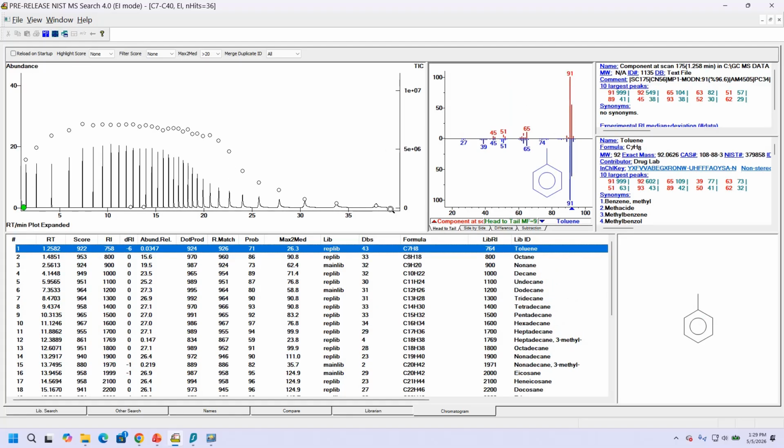So we expanded it now so that we have only the C8 through the C40. And you can see all of them here. What you can do is, I've used this max to med. It's somewhat a filter. It talks about it in the handout if you want to understand a little bit more about it, but essentially it's just a filter.